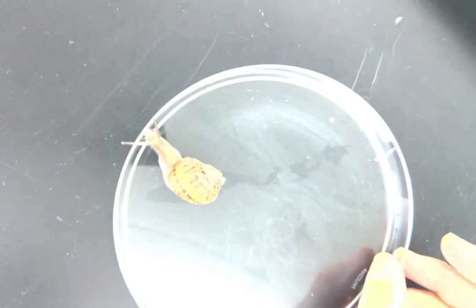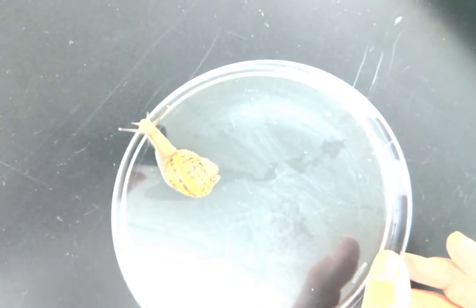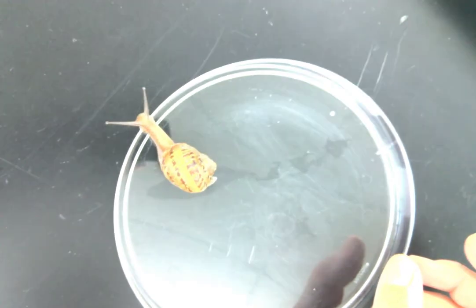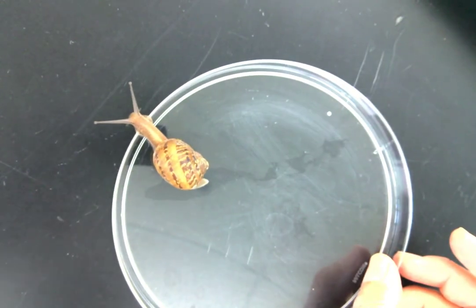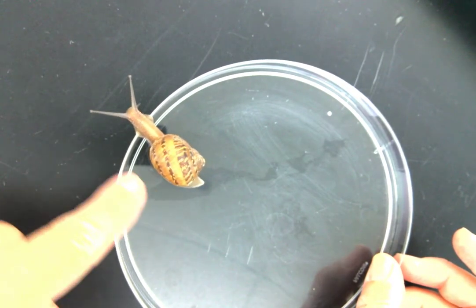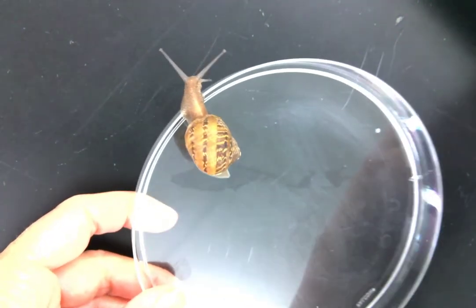Put it on this background too. Turn your exposure down. It's got these antennae. It's got its foot. It can probably feel things.